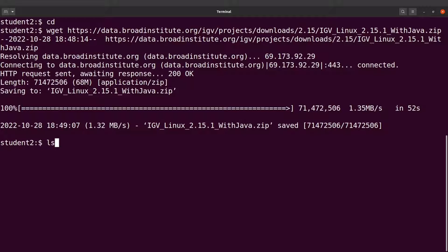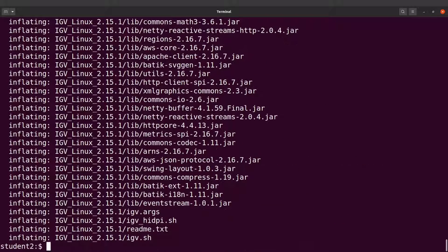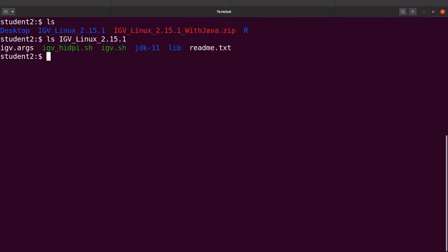The download is done. If we do an ls we can see the zip file. Next I'll extract the contents using unzip and specify the file name. After extraction, doing an ls shows a directory containing the binary. Inside the directory you'll also see the Java version that comes with the package, and the script used to open IGV is igv.sh.